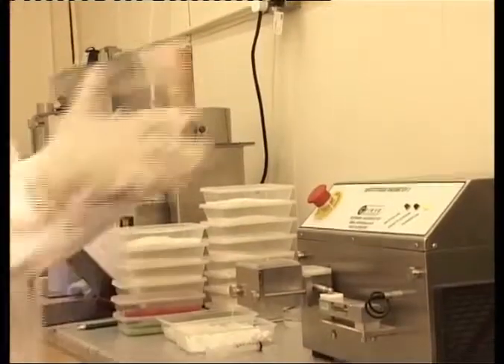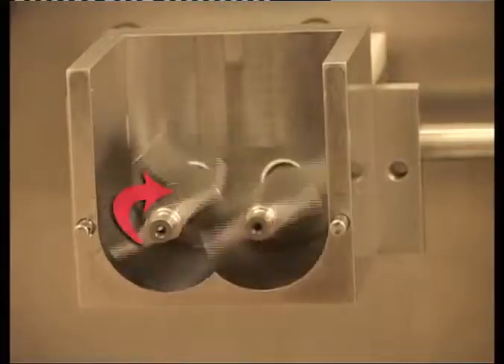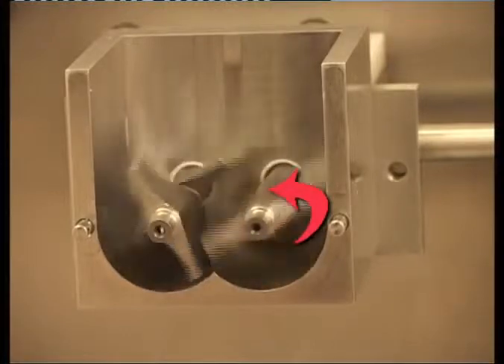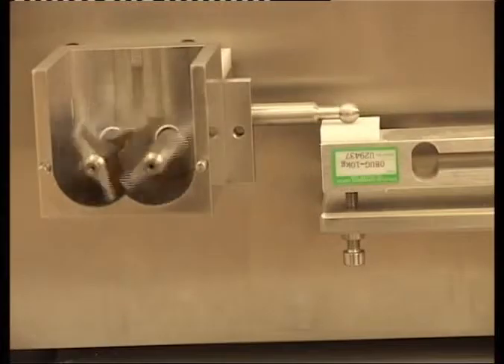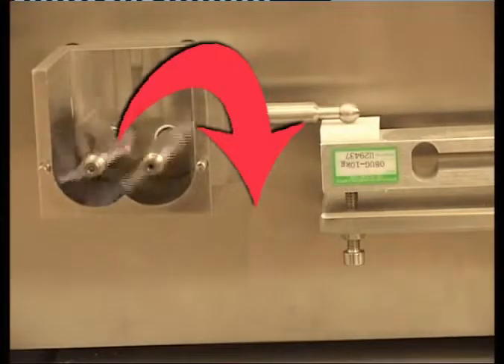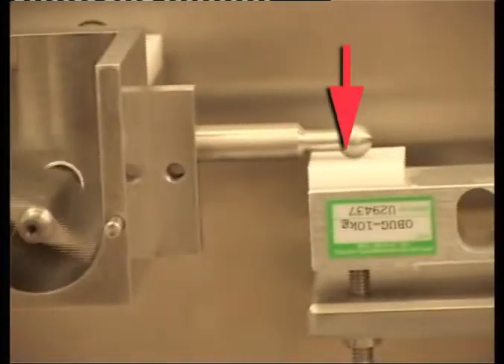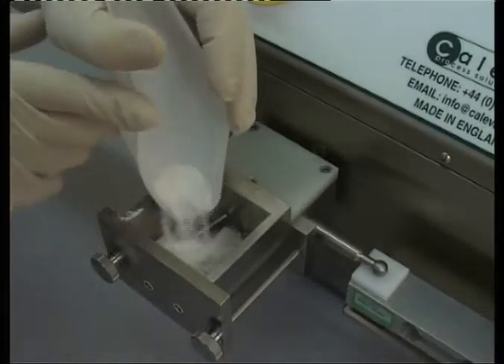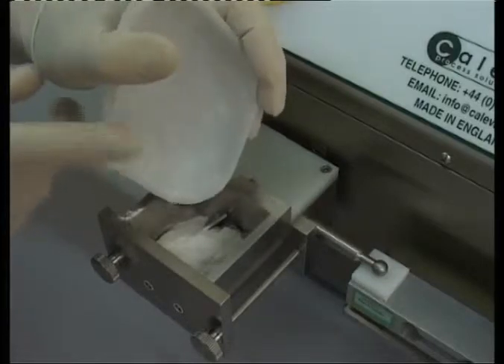The Mixer Torque Rheometer, MTR, comprises a mixing bowl containing two horizontal contra-rotating mixing blades. The secondary blade rotates at twice the speed of the primary blade. Since the bowl pivots about the primary drive shaft, the action of mixing a wet powder mass generates a torque, which is detected via a torque arm by a load cell. The torque generated is directly related to the consistency of the wet powder mass in the bowl.